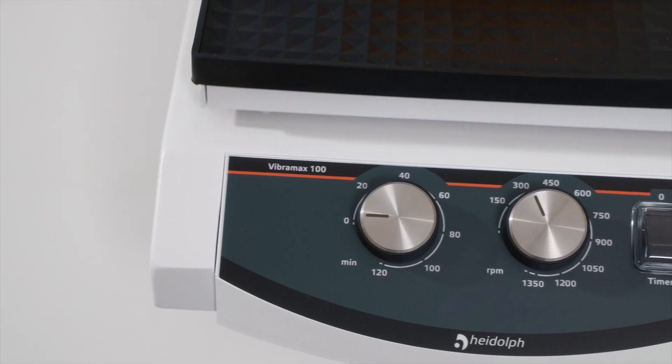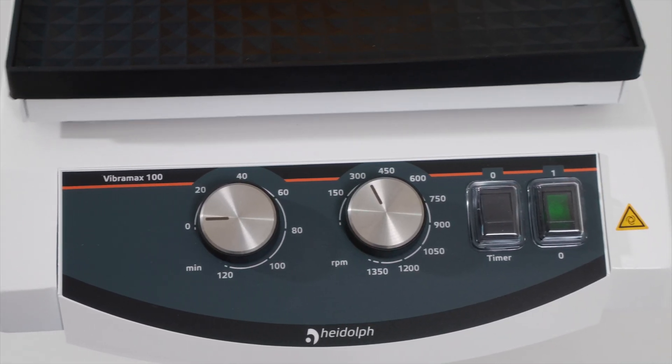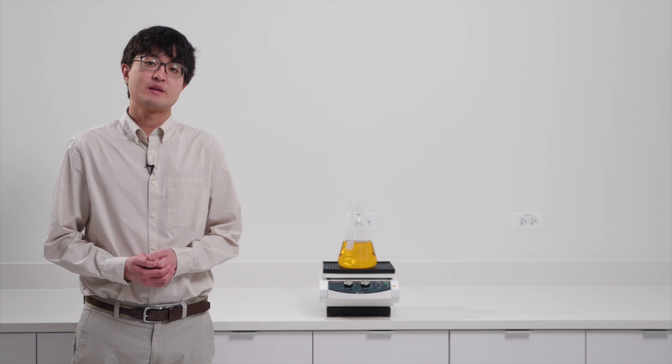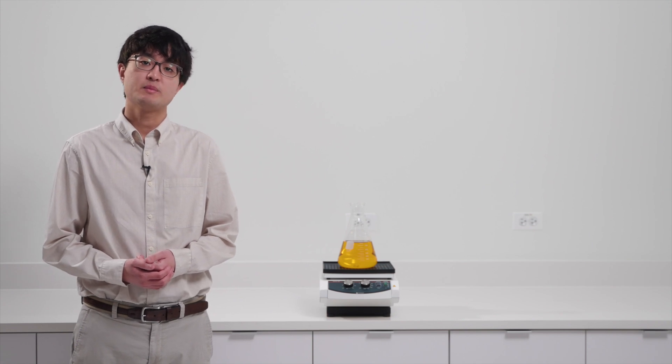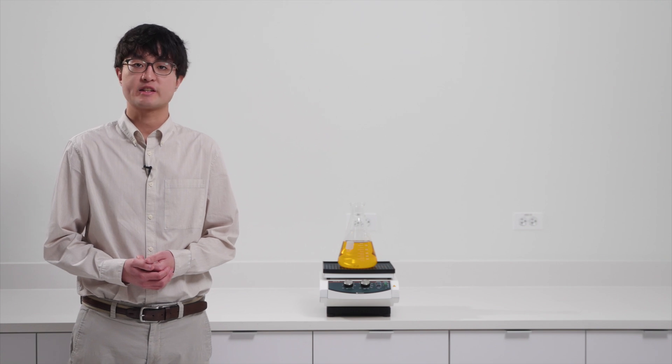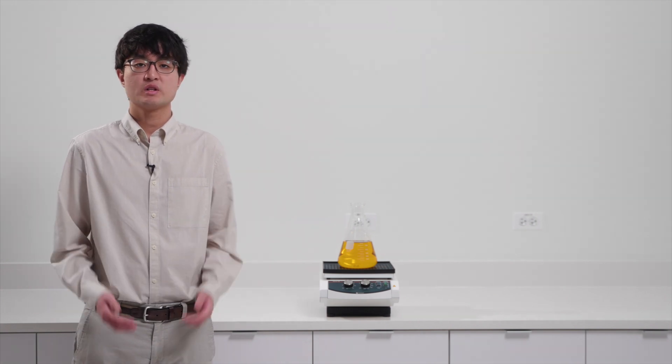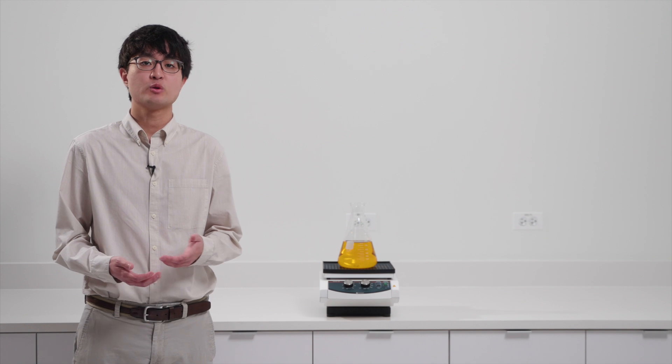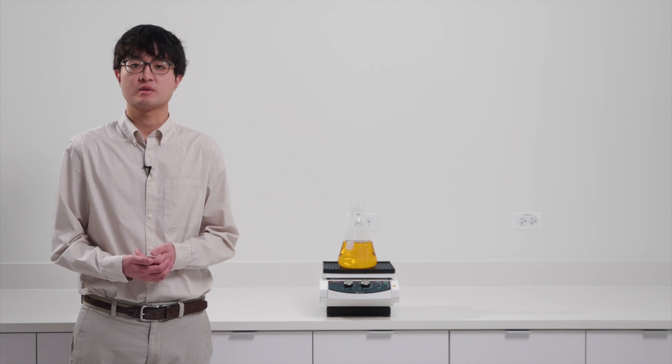Like the other three models, the Vibramax 100 comes with an integrated timer. More importantly, the Vibramax 100 comes with a 220x220 non-slip rubber mat, allowing a wide range of glassware to be securely held when in use. We also offer a tension roller attachment if you want a more secure fit for your glassware.